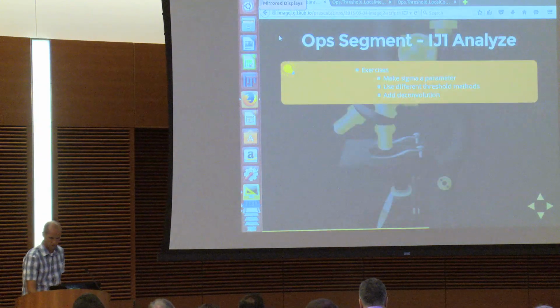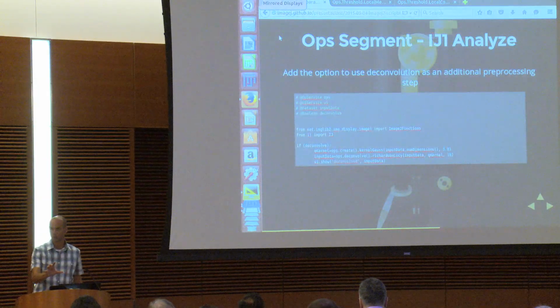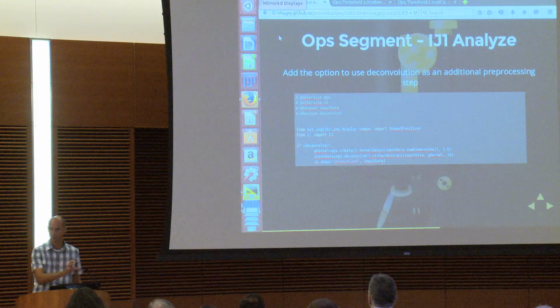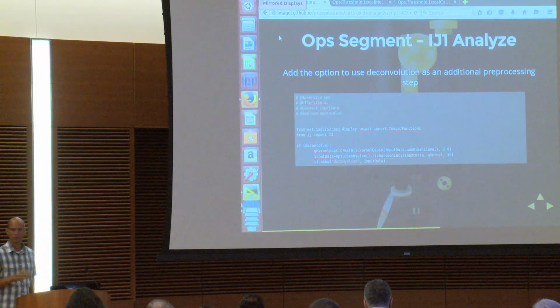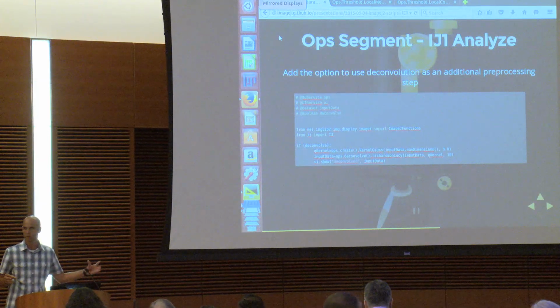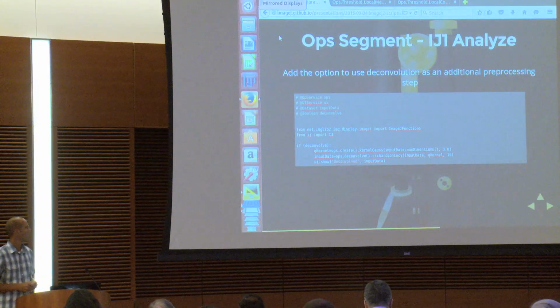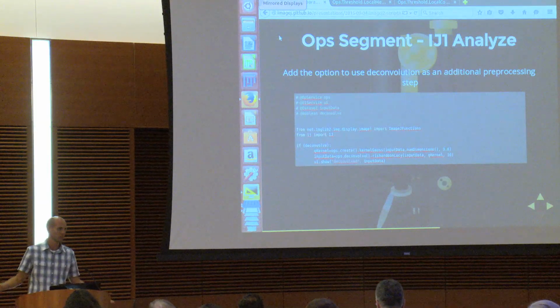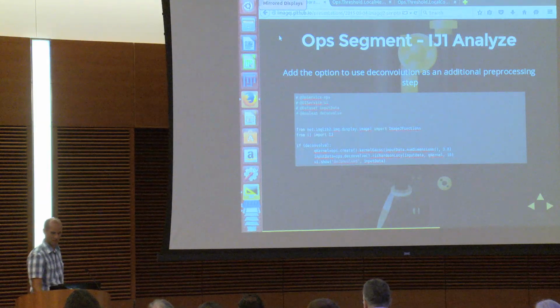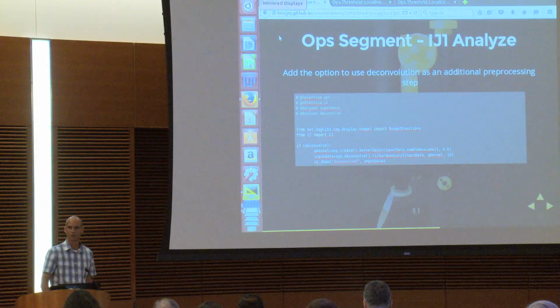So the code I just used is embedded in the presentation. Later on, if you want to, you can go back to this presentation, just cut out this code and embed it into the original script, and it should run. And if there are any problems with that, just ask a question on the listserv or Gitter. Are there any questions about that workflow?